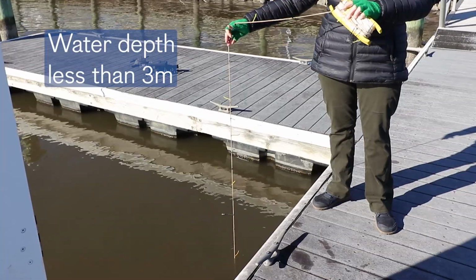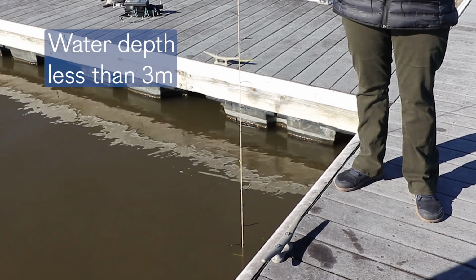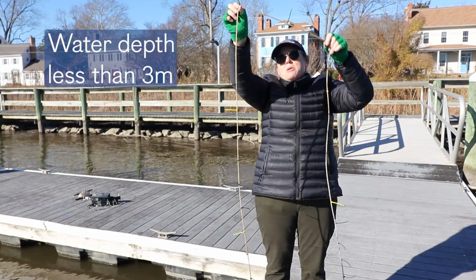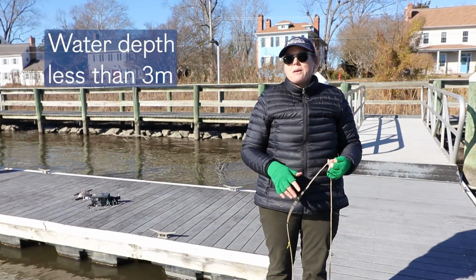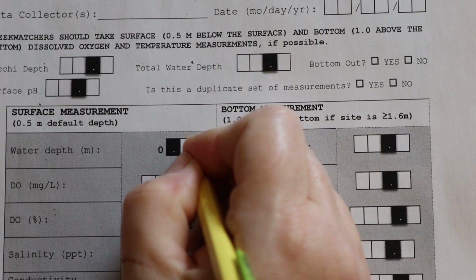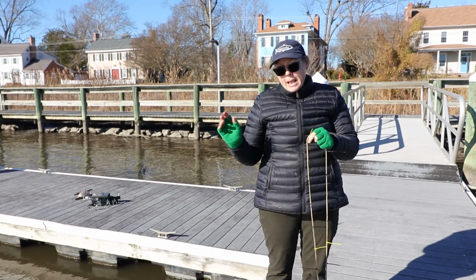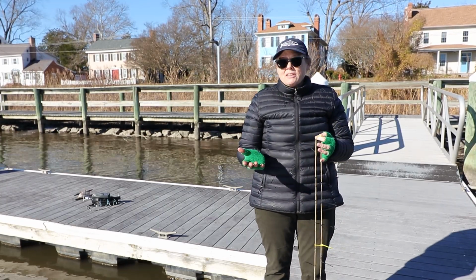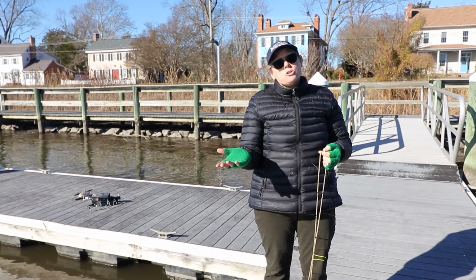At this location, it's a more typical site for what we see. Here, our total water depth is just under 2 meters. So we came in at 1.9 meters. This means that we're going to take both a surface water measurement at 1/2 meter deep, or 0.5, and we're also going to take a bottom water measurement 1 meter above the bottom. And what we do to calculate that depth is we simply subtract 1 from the total water depth.